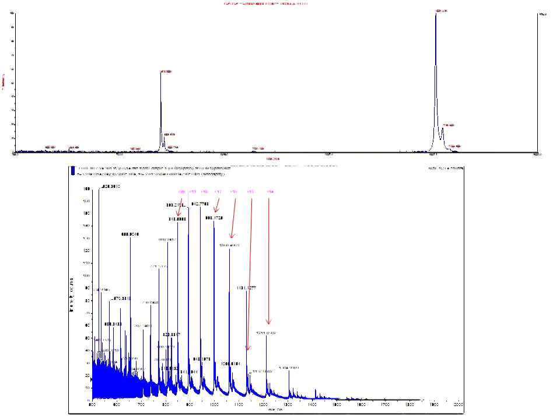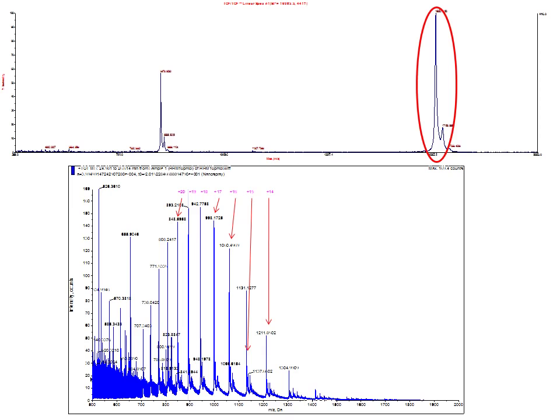To illustrate the main difference between MALDI and electrospray, we can observe these two spectra of myoglobin, a protein with a mass of 16,952 daltons. In the upper spectra from MALDI, we see the singly charged ion at 16,952, and an ion of myoglobin with two charges at half of that mass. In the electrospray spectra, we can see the multiple charge states of different populations of myoglobin ions.